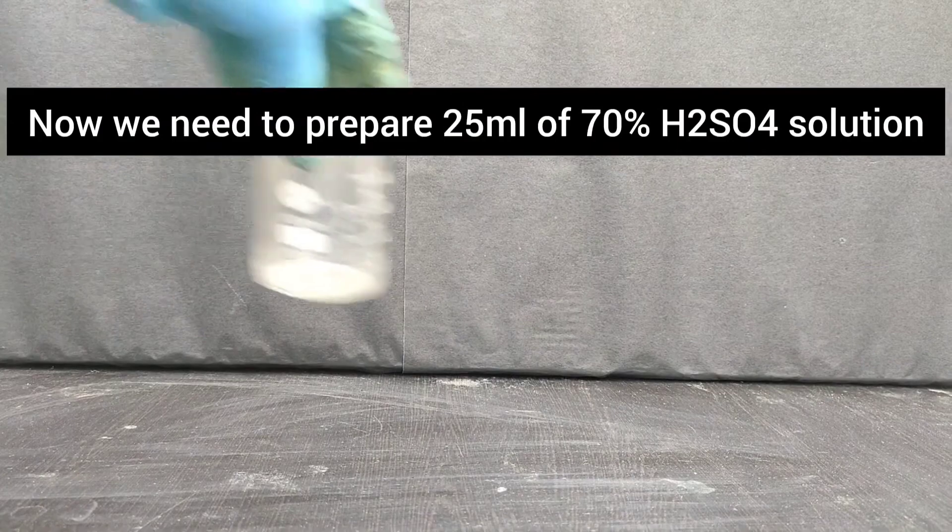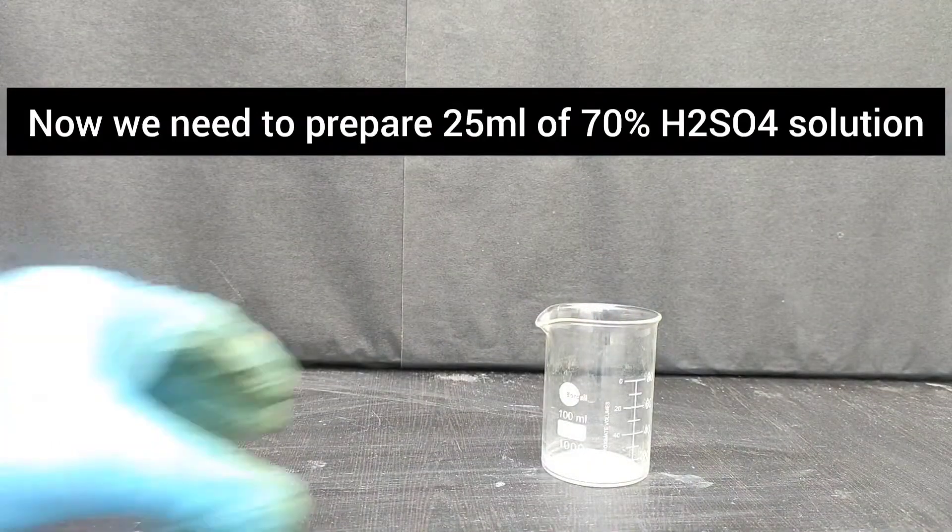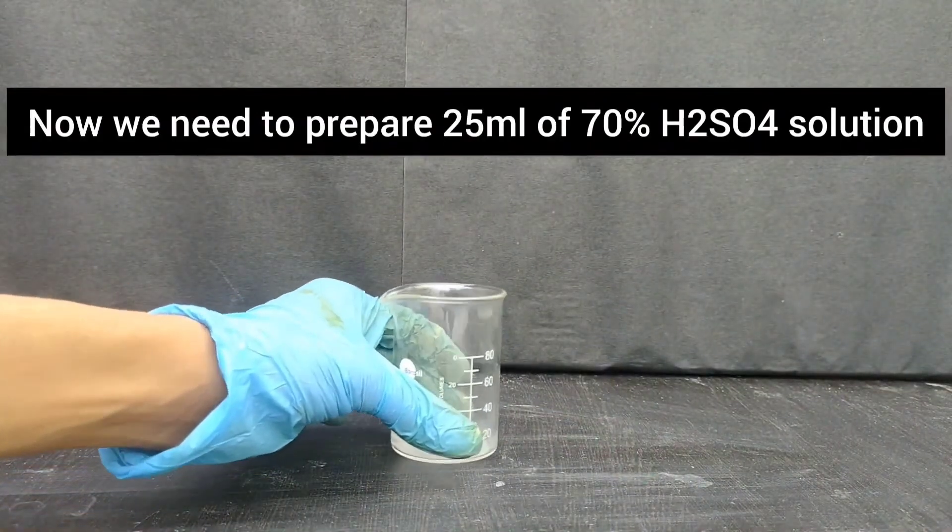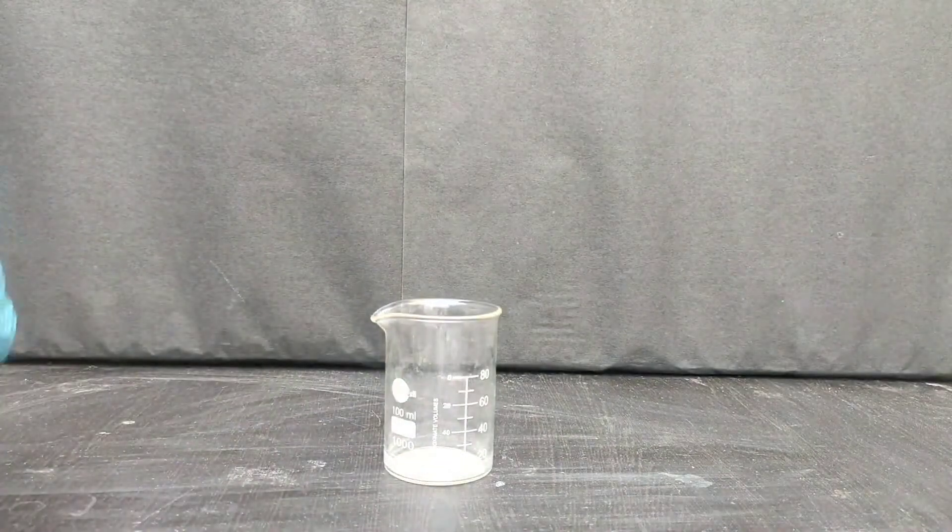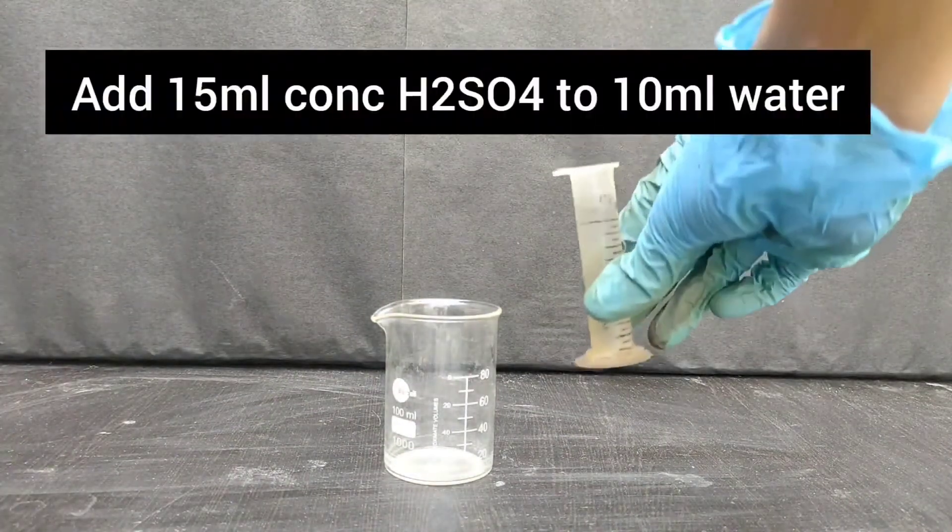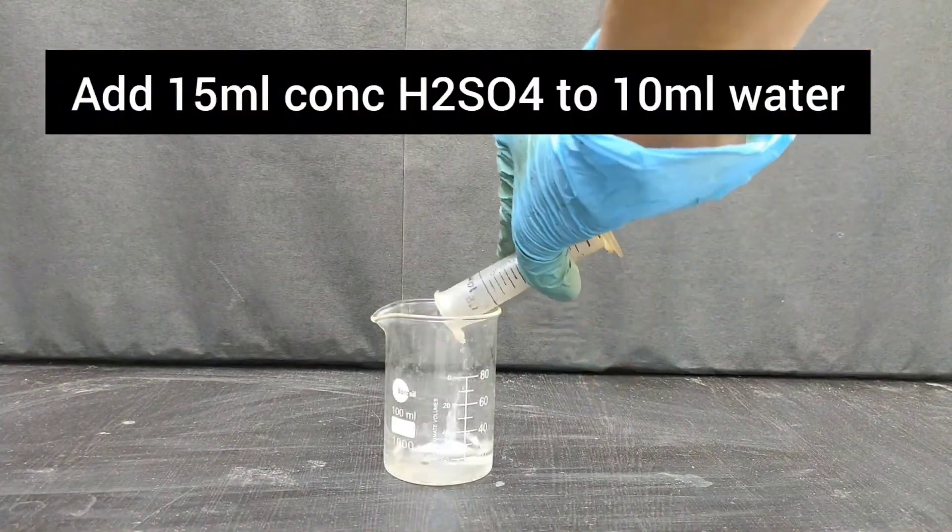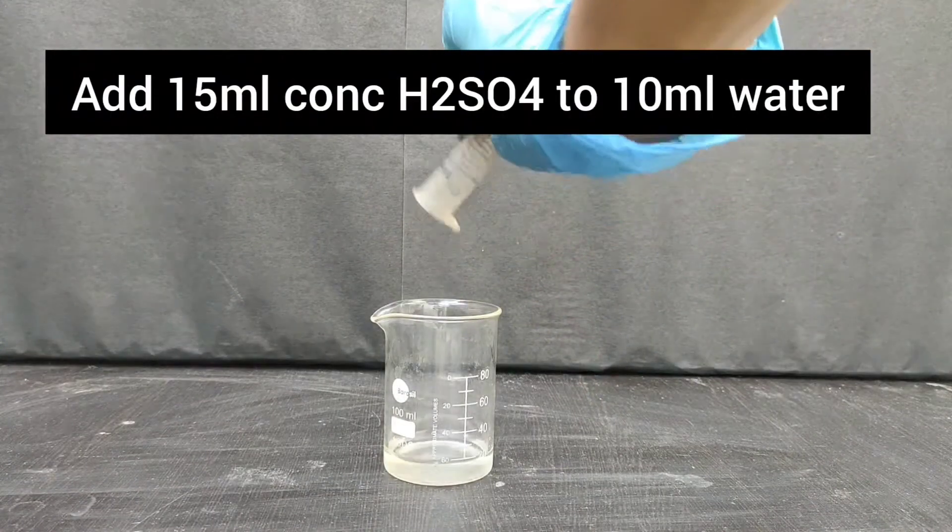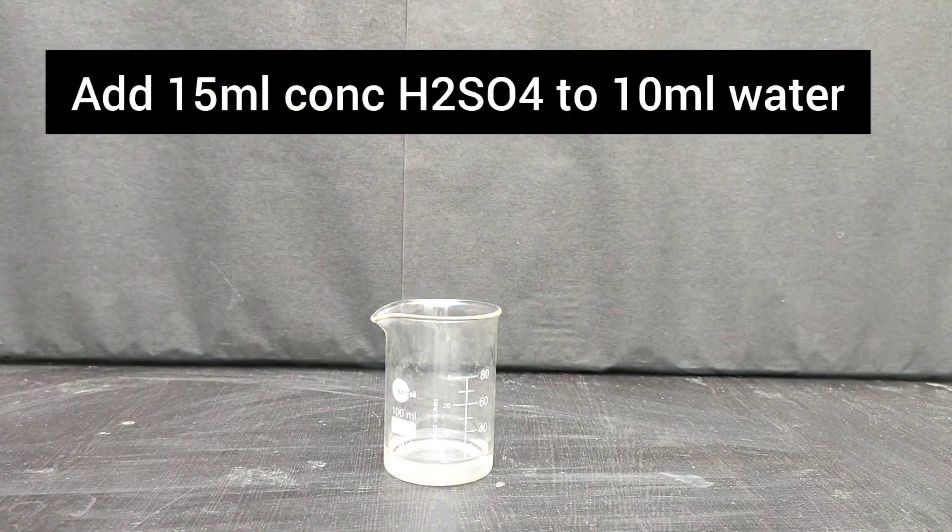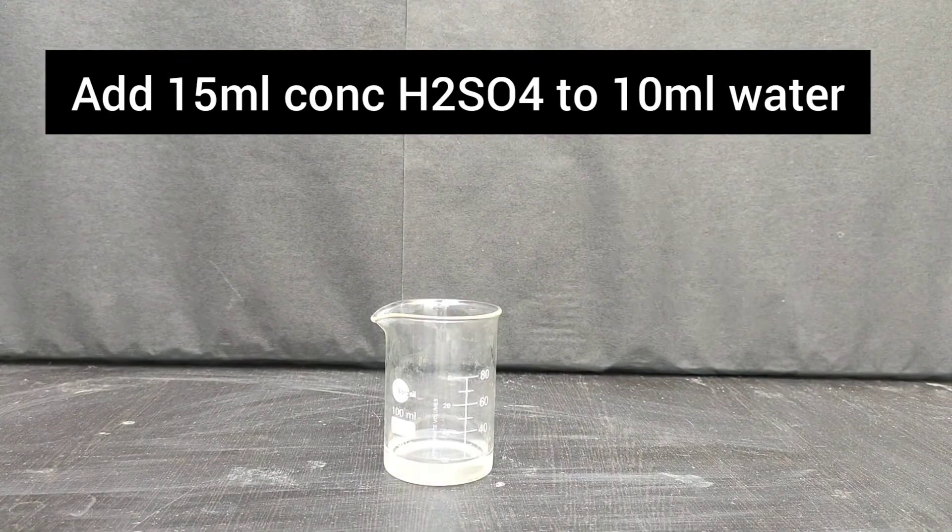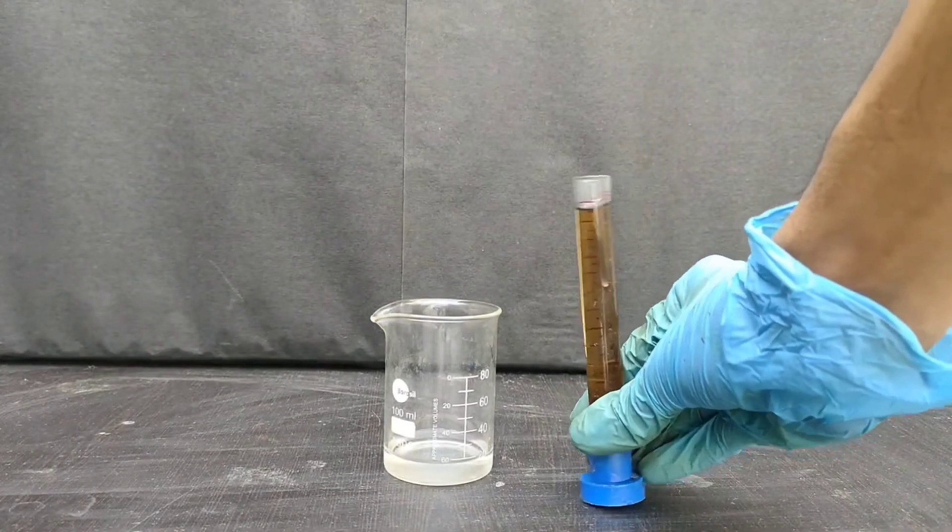Now, we will prepare 25 ml of 70% sulfuric acid solution. For that, in a beaker, we will take 10 ml of water, and to this, we will add 15 ml of concentrated sulfuric acid.